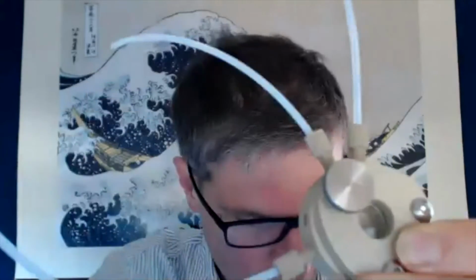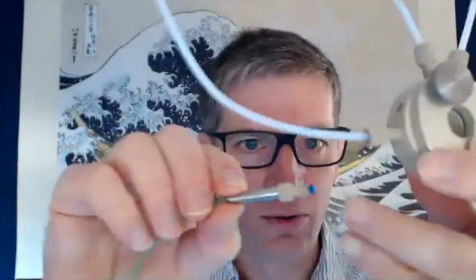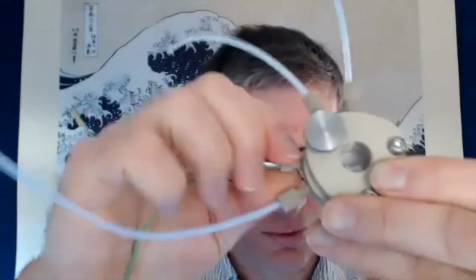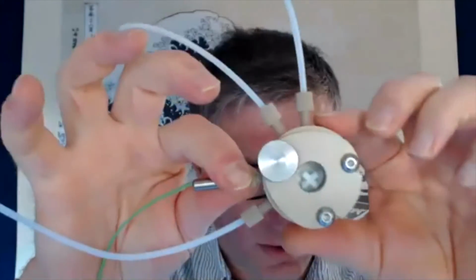Then you can put instrumentation in. If I take this port out, this is just a standard thermocouple going through a standard HPLC fitting, and that can screw in the side so you can measure temperature. So that's the single units that we'll be talking about, and I'll show you how those fit together. I'll show you that now before I go into PowerPoint. So let me just share my screen.